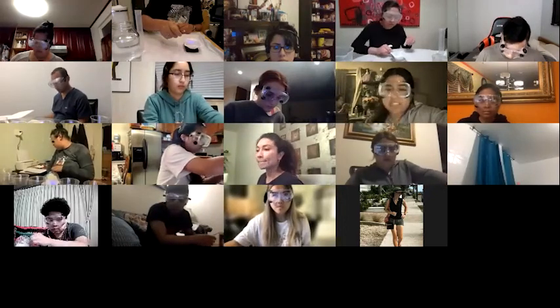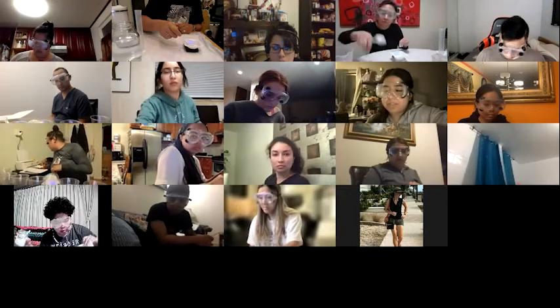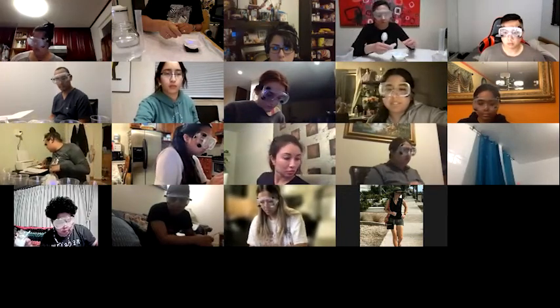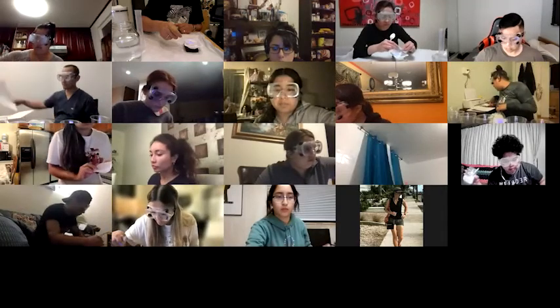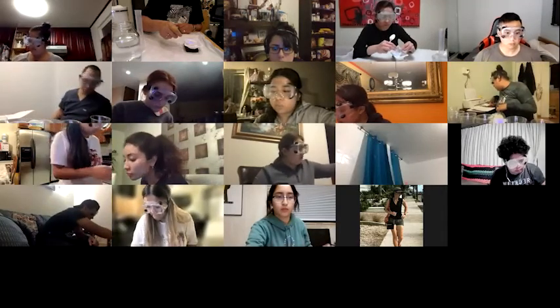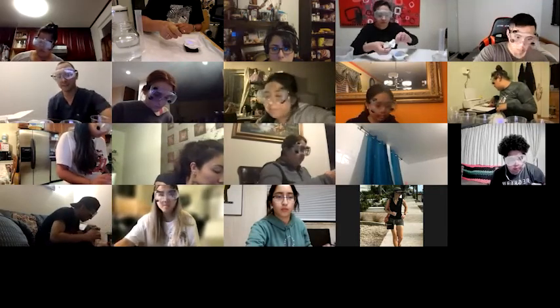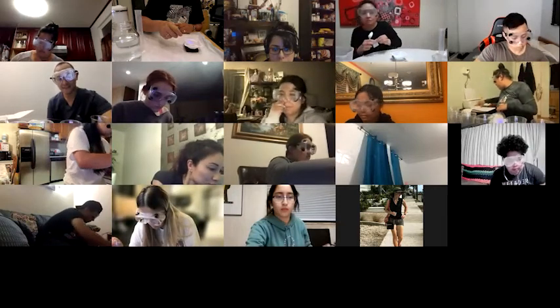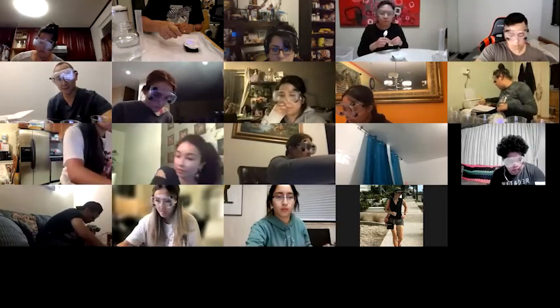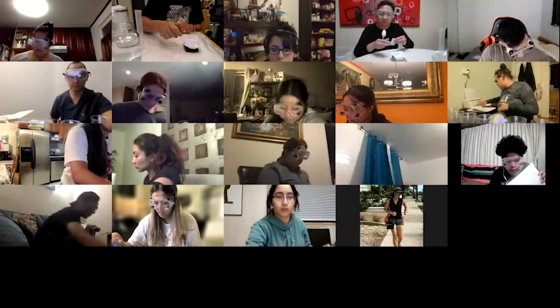Professor, I have a question. Mm-hmm. Can we use the raw brown sugar, or does it have to be the white sugar? White sugar, because the raw brown sugar has molasses in it. So, I mean, if that's all you have, then that's all you have. One of the questions in your report is looking for sources of error, so you would write that down as a potential source of error.